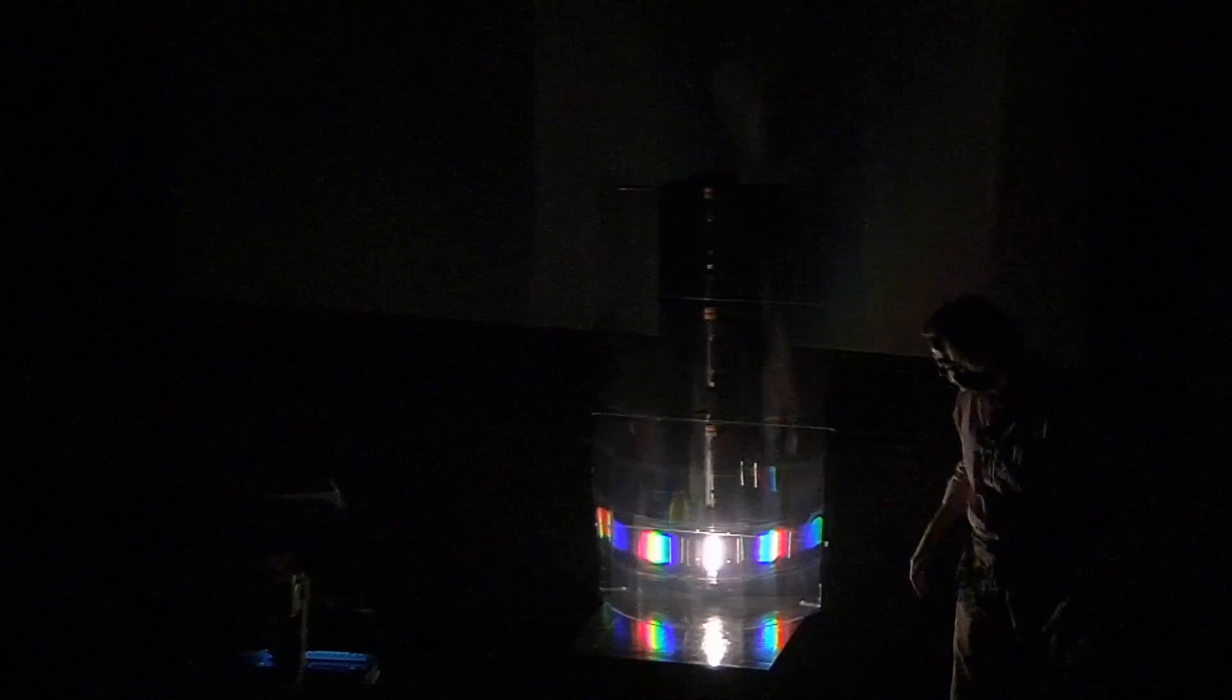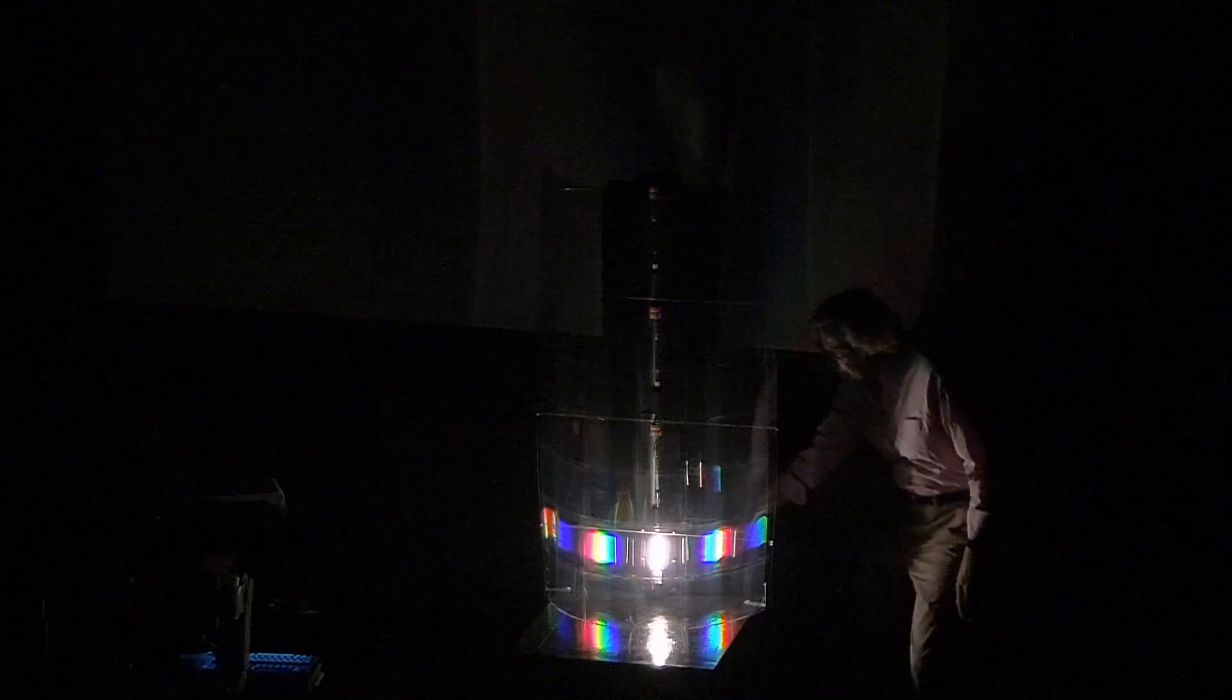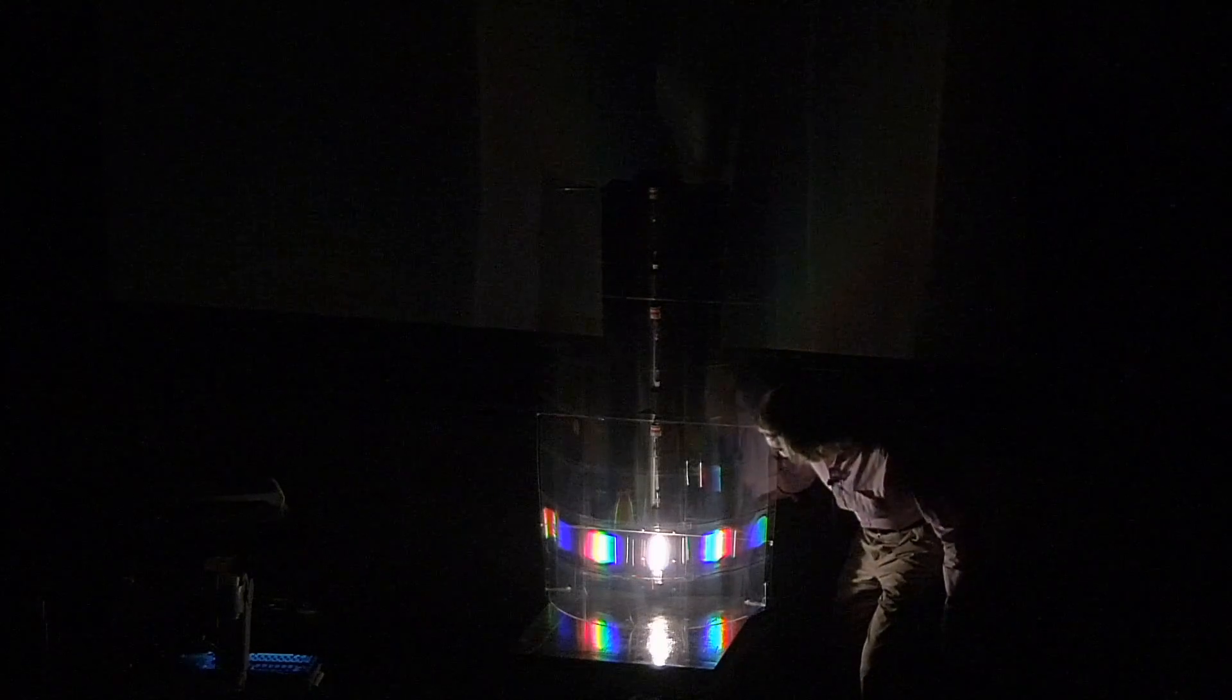But what is different is this thing in front. This thing in front is acting like a prism. It's dividing that white light into the different colors. Okay, but let me now switch that one off, and I'm going to switch that one on, and this is mercury.